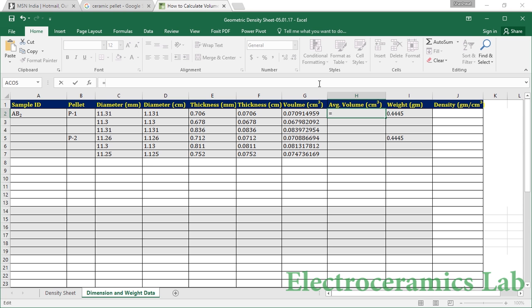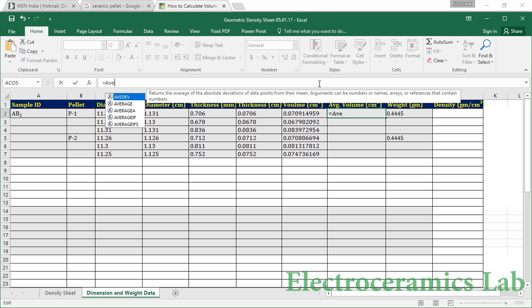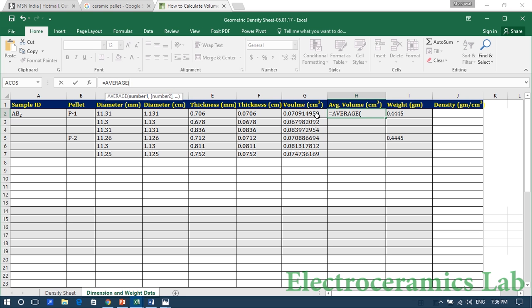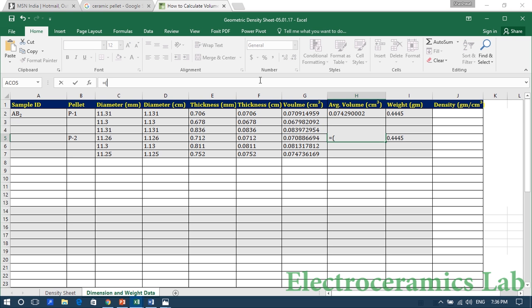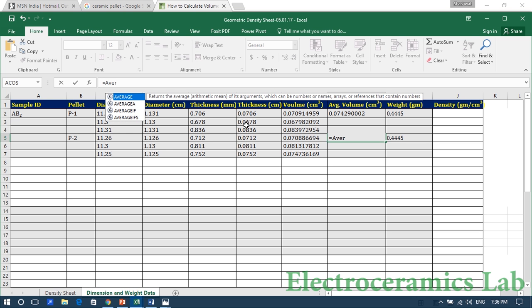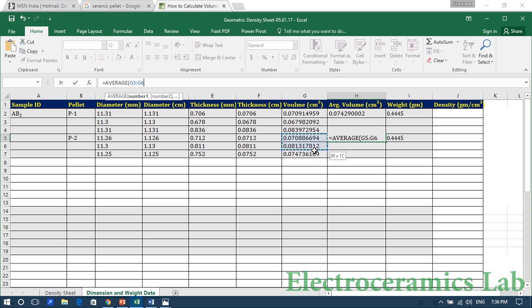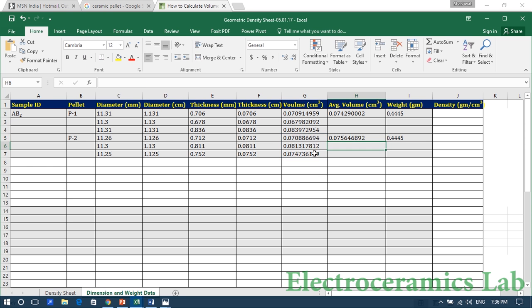Now we are taking the average of this data set. Type AVERAGE, select the three data set values, and close the bracket. This gives the average volume of pellet one. Similarly, apply the AVERAGE function for pellet two to get the average volume of pellet two.